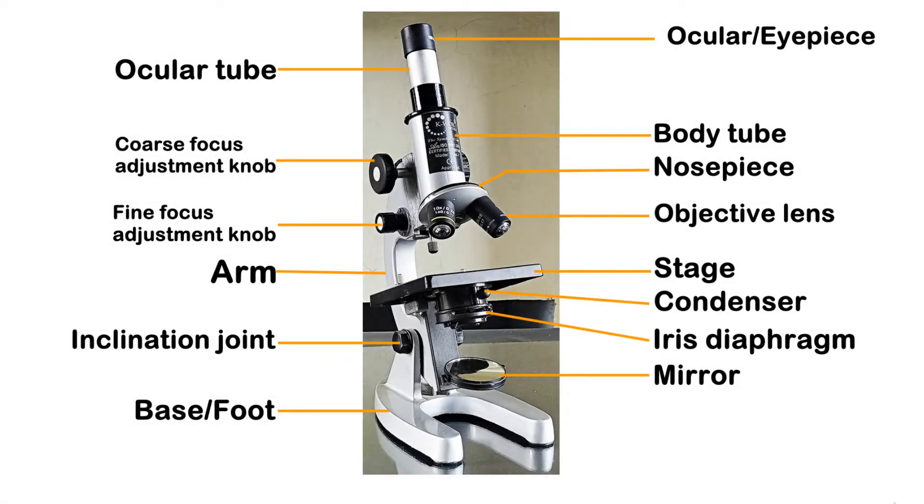So here we go. To begin with, here's a quick pictorial overview of the different component parts of a typical monocular compound brightfield light microscope that you'd normally come across in a high school and even in a college-level biology lab setting.